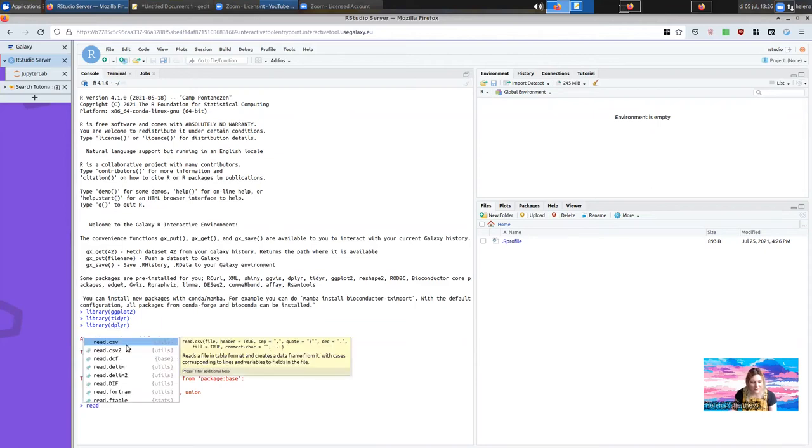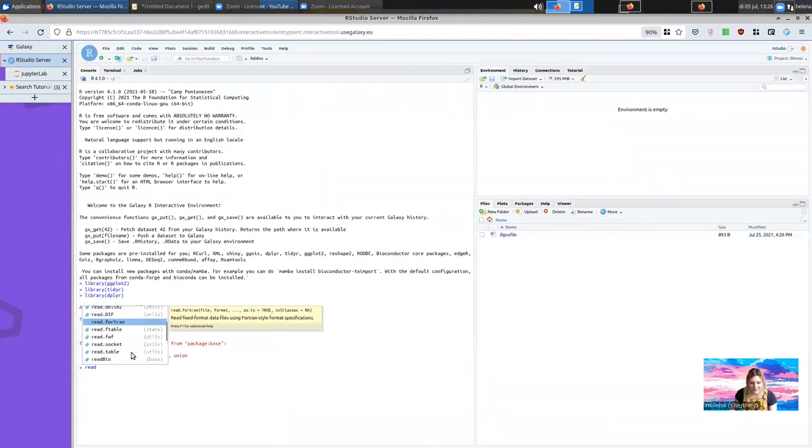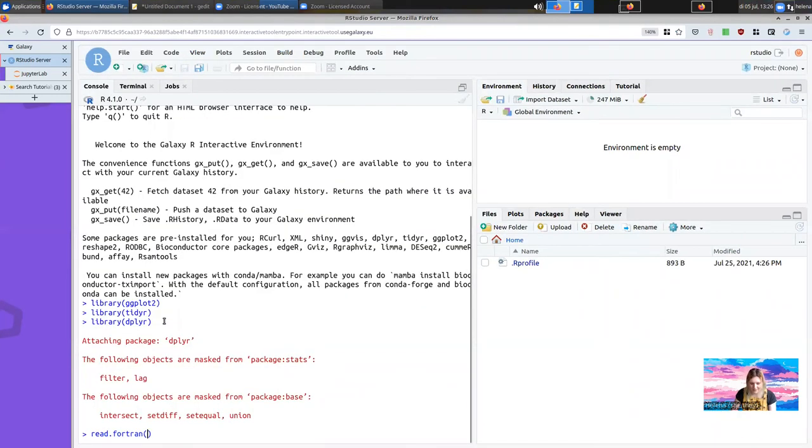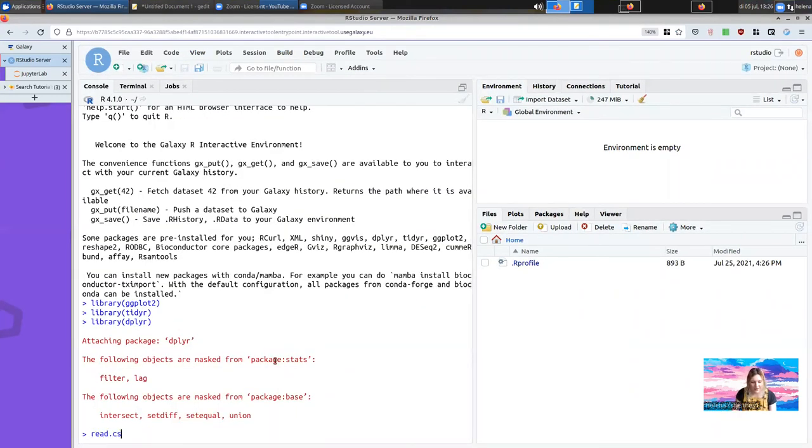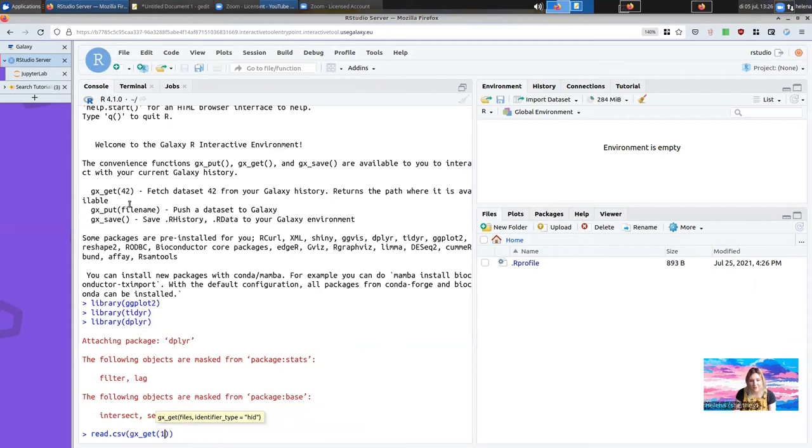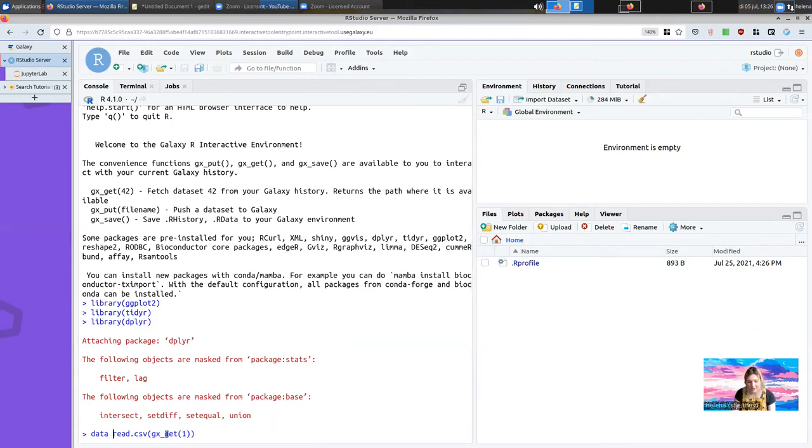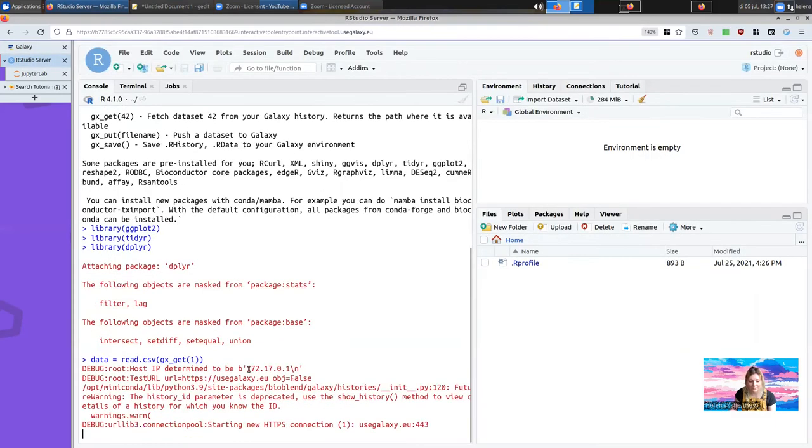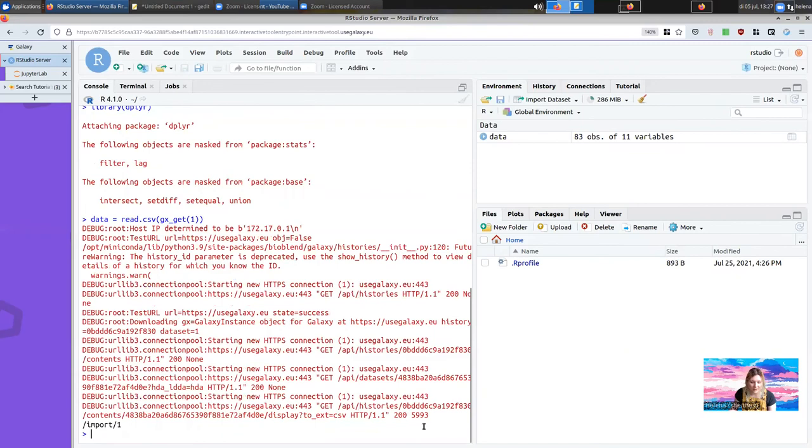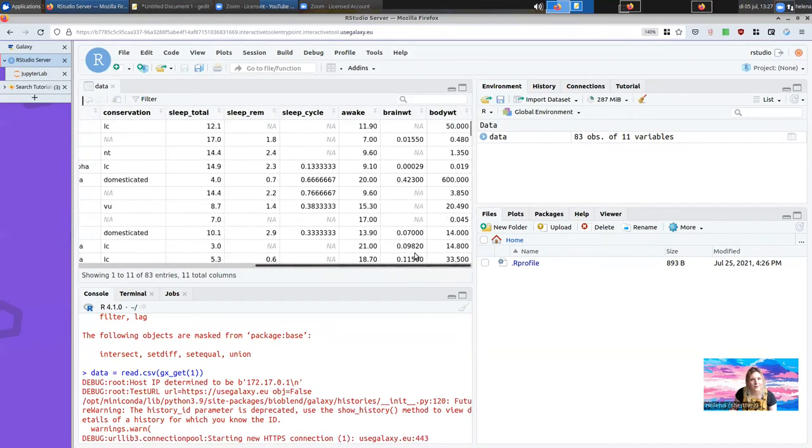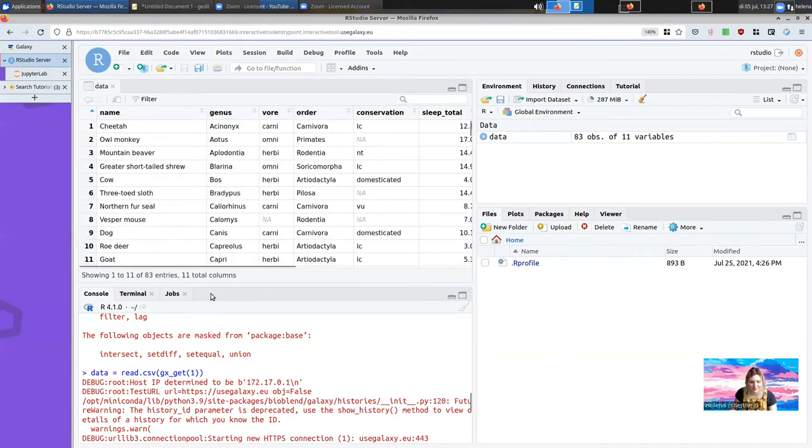As usual with RStudio, it's just like the desktop RStudio, you have access to all of your normal functions. But now you have access to a new gxget function, which can be used to fetch data sets from your history in just the same way as the Jupyter notebook. Here we'll read the gxget1 into a data object, and this is based on the first element in our Galaxy history. It'll go fetch all of that data from Galaxy, and we'll be able to preview it, seeing all the same data that we saw in Galaxy.